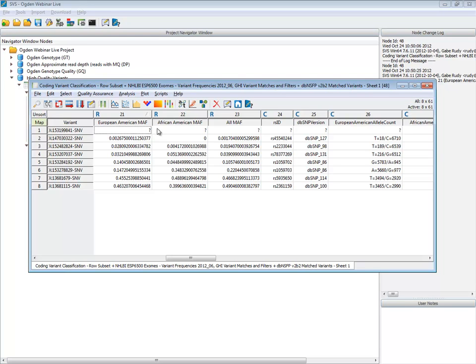It doesn't have an entry in the database of known variants. And you can see actually quite a few of these are common, to the point of being 40%, 14%, 3%, 2%. So this one's interesting. It's below 1%, and that's actually very rare, especially in such a large cohort of just Europeans. So we might want to keep an eye on that.